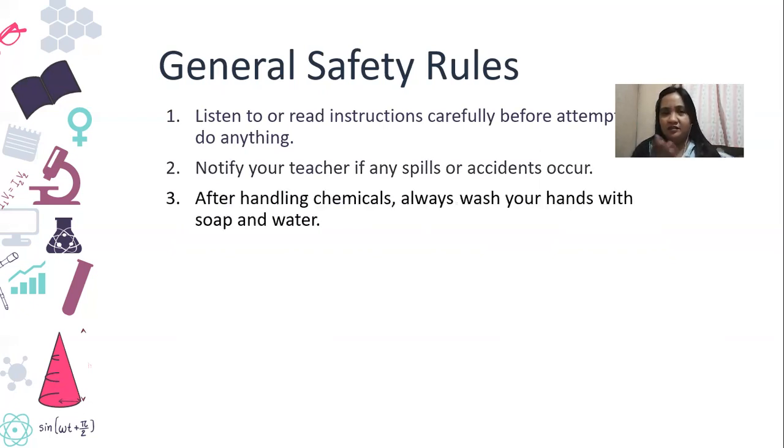Also, after handling chemicals, always wash your hands with soap and water. Right now, this is already a practice not only in handling chemicals, but since we are in a COVID environment, make sure that after coming from outside, you always wash your hands so as to avoid touching your face after you go outside. So always wash your hands with soap and water. Do the birthday song. I think you know that. You can sing happy birthday to you until you finish. That's, I think, the length of time you have to use for washing your hands.